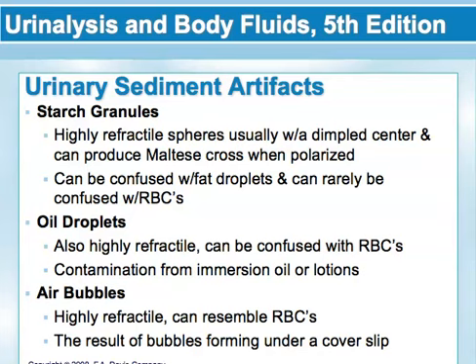Oil droplets also are very highly refractile. They can sometimes be confused with red cells, but they come from contamination with immersion oils or lotions. Air bubbles, also highly refractile, can sometimes resemble red cells. These are just the result of bubbles forming under a cover slip.